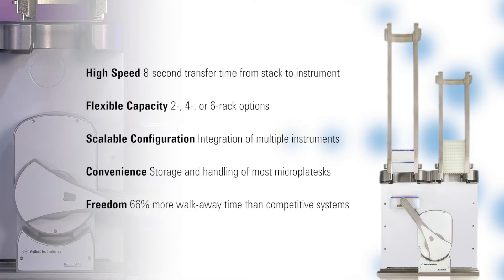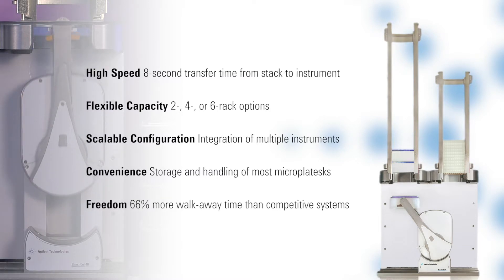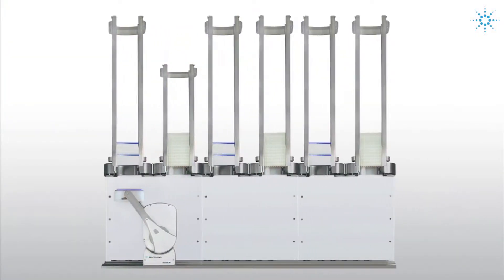At the center of our instrument is the Bench Cell Microplate Handler. This system is designed to give you a very fast and efficient transfer between our different racks and various instruments. The Bench Cell itself comes with multiple configurations — either two, four, or six racks.